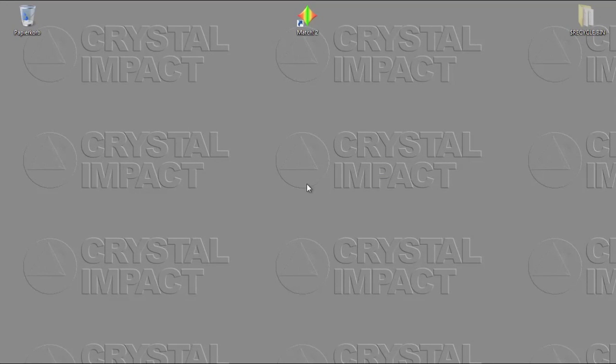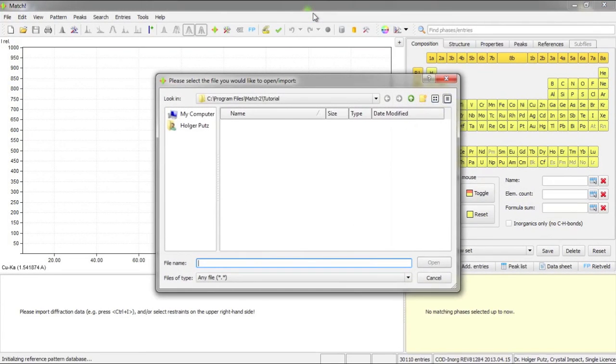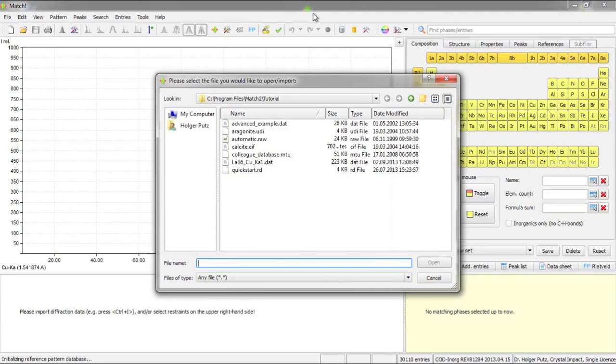First of all I have to run the MATCH software which can be done by double-clicking here on this icon on the desktop. MATCH automatically asks for the diffraction data file we would like to import.